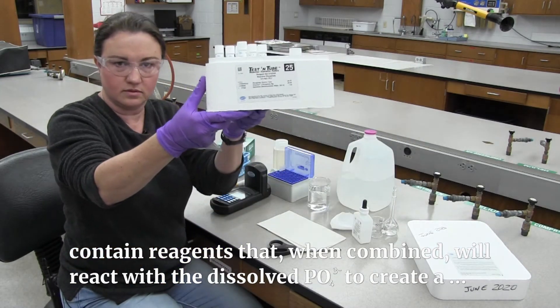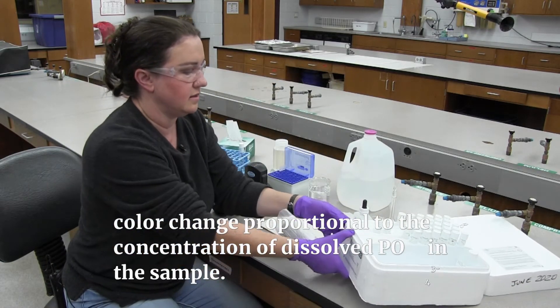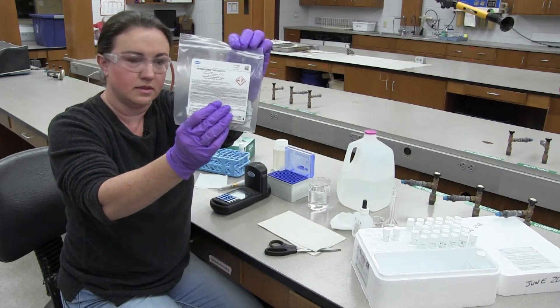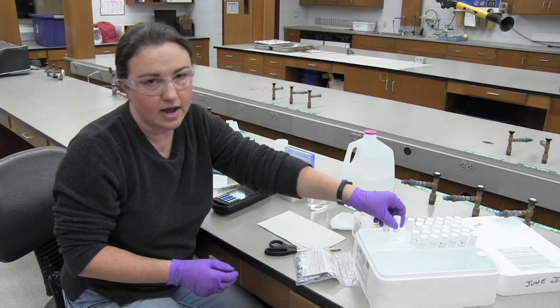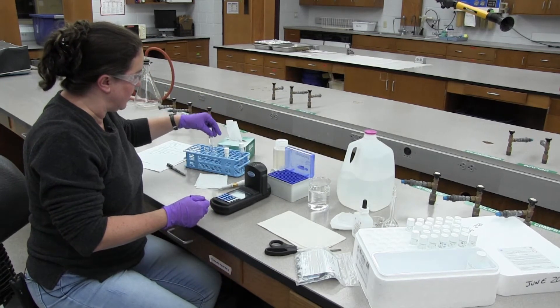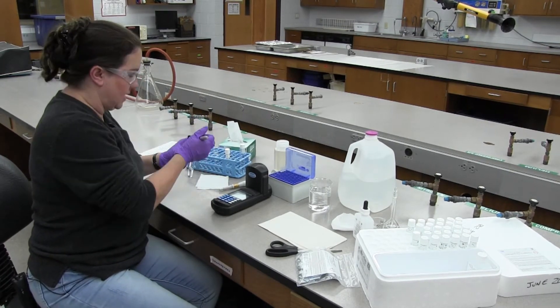Here's a look at the kit with the reagent powder pillows. I'm going to take two vials out of the kit because I'm going to be running a standard and a sample. I'm going to label those.